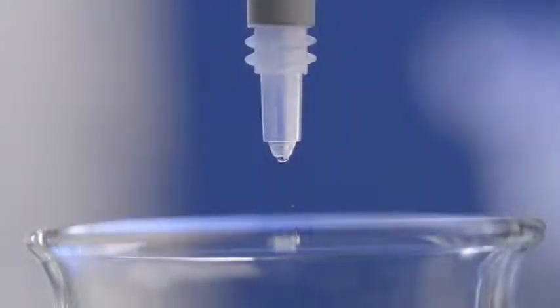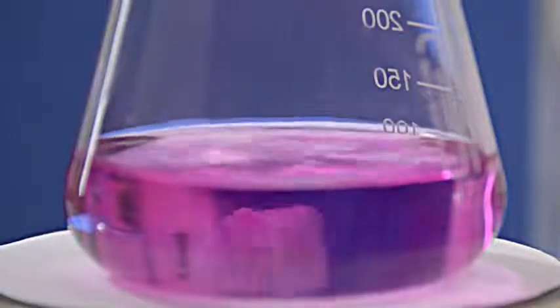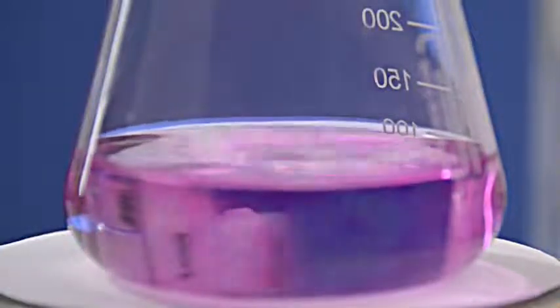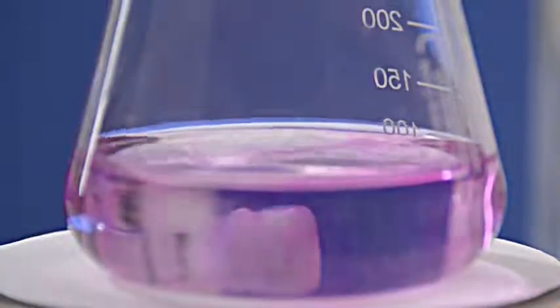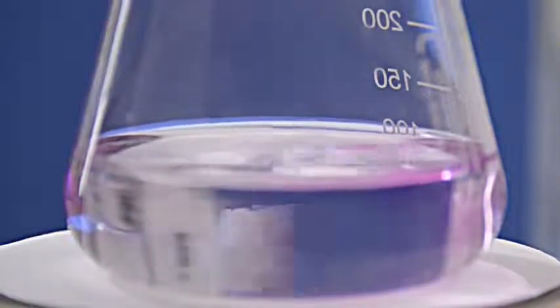Determining the end point, drop by drop, if necessary, even to three decimal places — no problem for the Titrate! Using it, you can titrate quickly and reliably within the error limits of Class A.